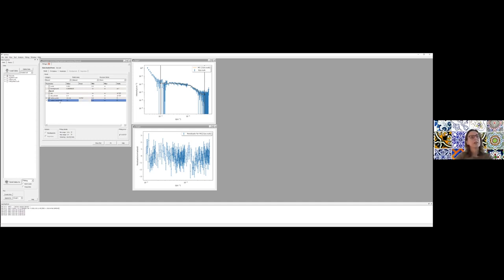What I did is I changed it manually, but I kept it fixed. And then I left the other one ticked to see if by increasing this one, the ratio would look more like what I expected or what I know from the lysozyme structure.